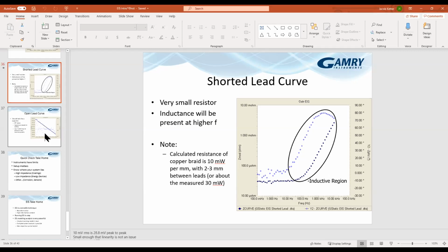Okay. So we have another question here in chat, but I'm going to go ahead and jump on this one. The question is, how do we evaluate the performance of a coating with the Bode and the Nyquist plot, and what are the most critical parameters?